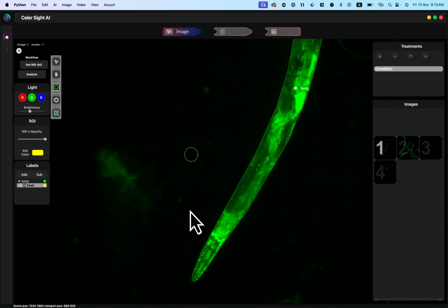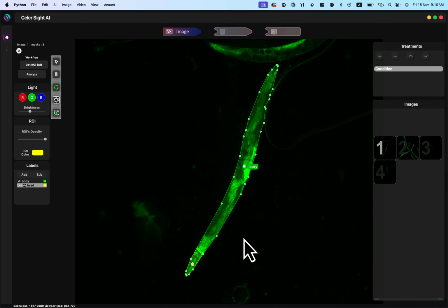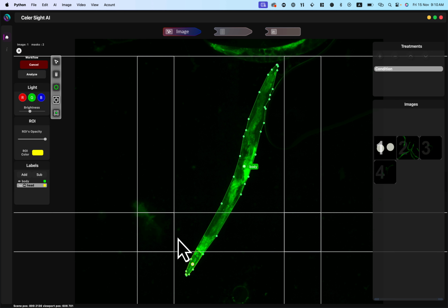What this means is that we can just create ROI right here. And as you can see, it doesn't go over the area of the parent right here. Great. So we don't want to go ahead and regenerate all the regions of interest for the body, since we already have them, we can go over here to the class, right click on the head, and select Get ROI. This will initiate the process just for the head.